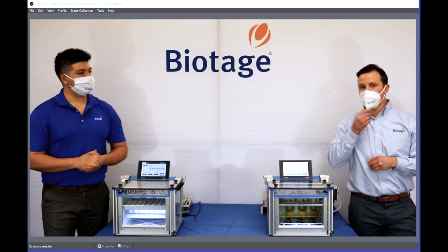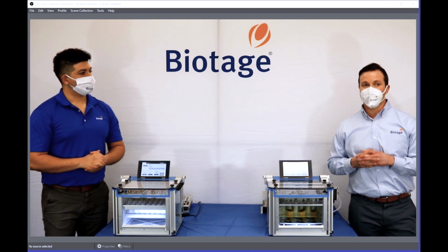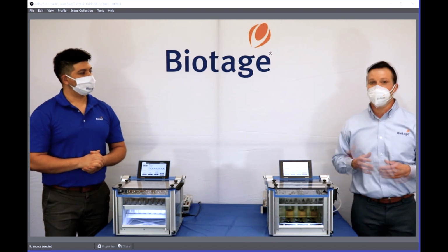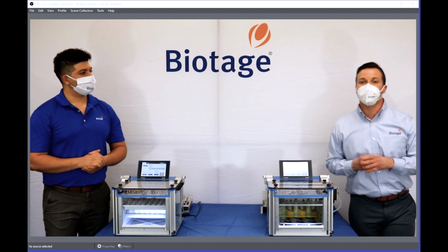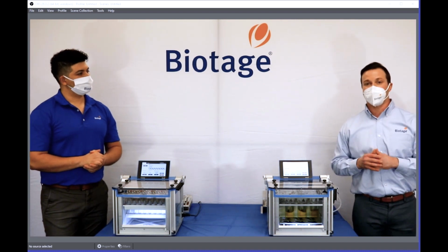Now, there are labs that I have encountered using clean air, as long as it does not react with your compounds or analytes of interest. I've seen labs do it before. So it's really dependent on what analytes you're looking at and how they react with oxygen. Nitrogen's great because it's inert gas, so it won't react with most analytes.